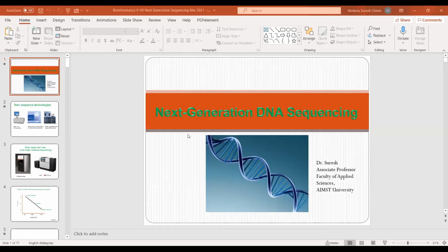next generation sequencing, which starts with pyrosequencing as a drastic improvement in the technology. In Sanger sequencing, with advanced technology, you can use a 96 well plate, and thus you can sequence 96 DNA sequences at the same time.